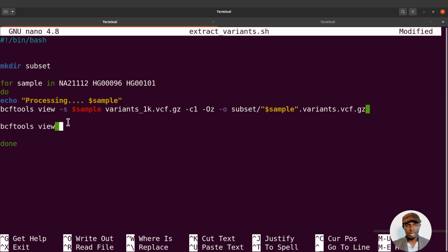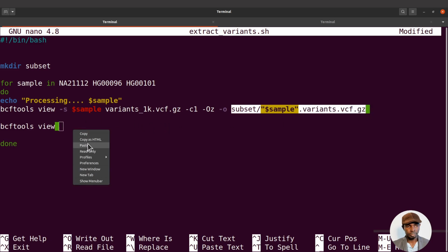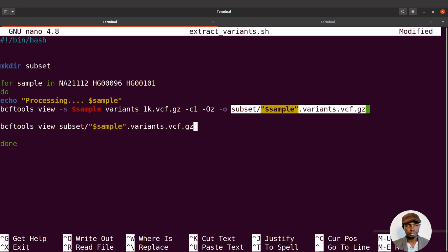This time I have generated the file, so I can specify it here. And then I bring my grep, grep -vc, and I bring my pattern here like this. And then that's it.